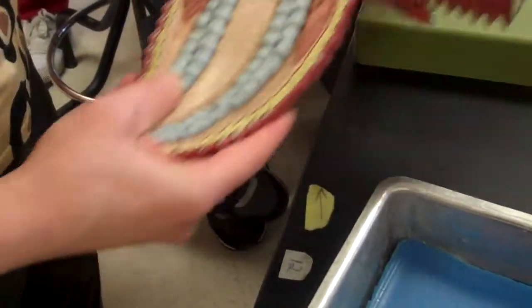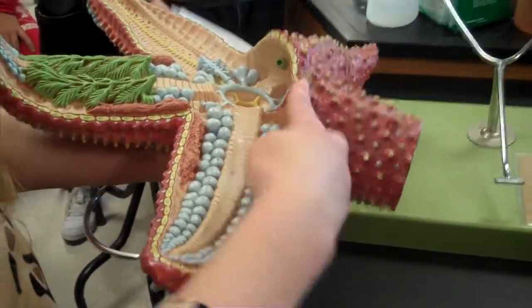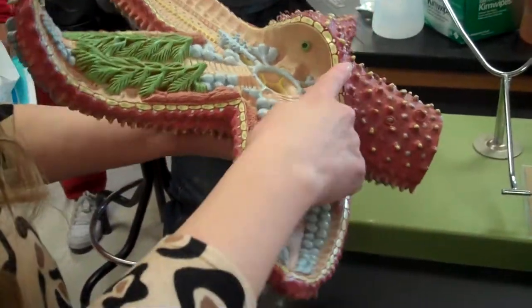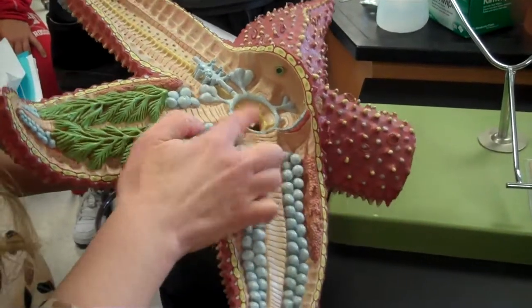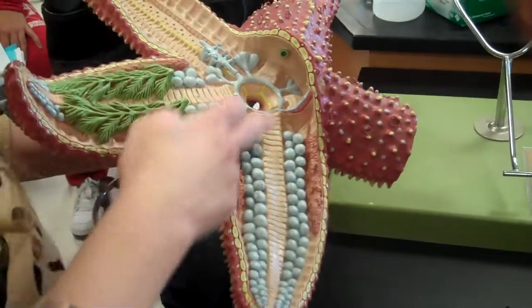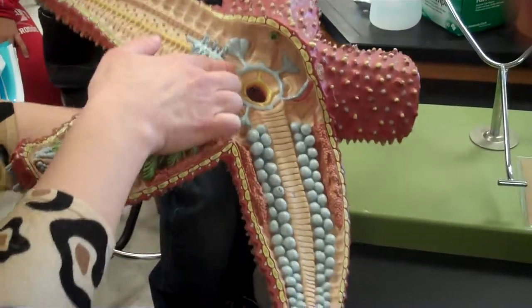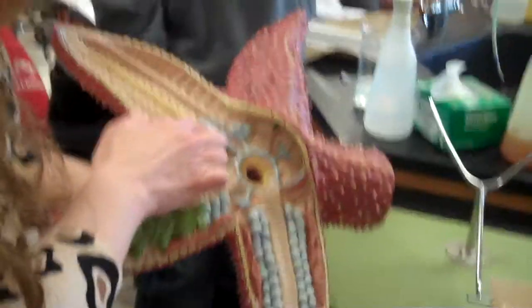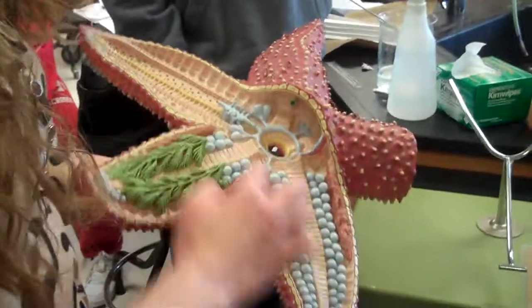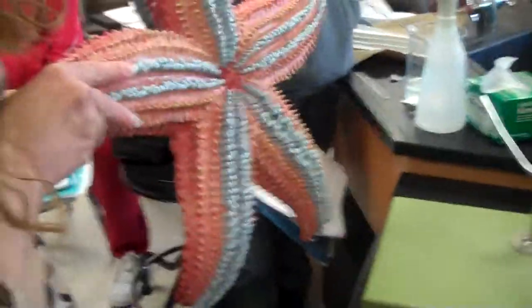Now the path of water through the water vascular system: this is the madriporite, the opening to the water vascular system. Water travels in there, down the stone canal, into the ring canal. Then the ring canal branches down each arm underneath the ambulacral ridge — you can see over here it's been removed. This would be the radial canal, which extends the whole length of the arm.